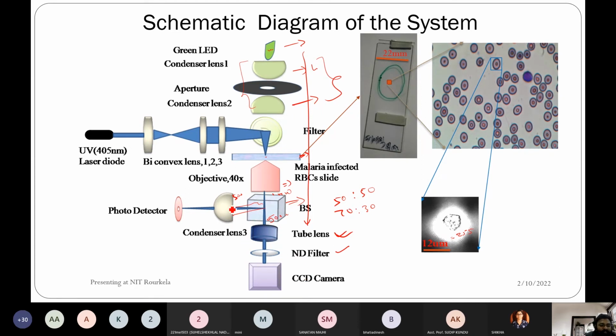Okay, and the condenser. So basically, this is the microscope setup. Generally, when you have a custom bright field transmission microscope, you have only this vertical line. But my thought was that I wanted to develop a spectroscopy, an absorption measurement instrument. So in that case I have to design this one only if I want to measure the absorption.